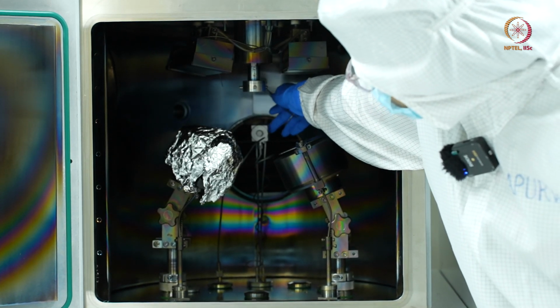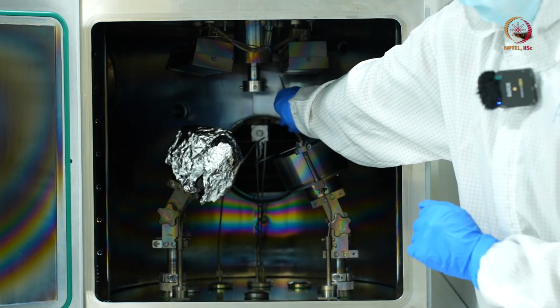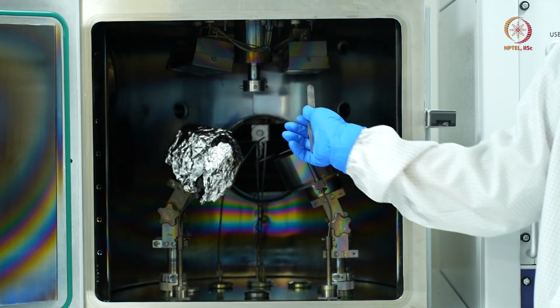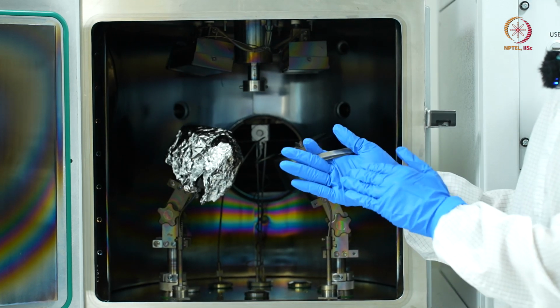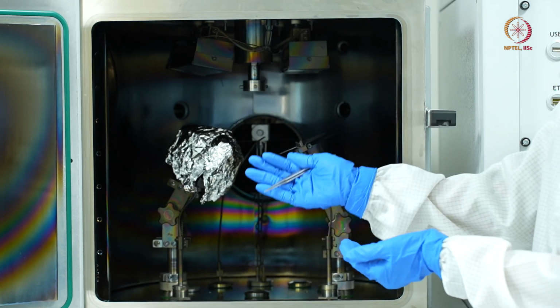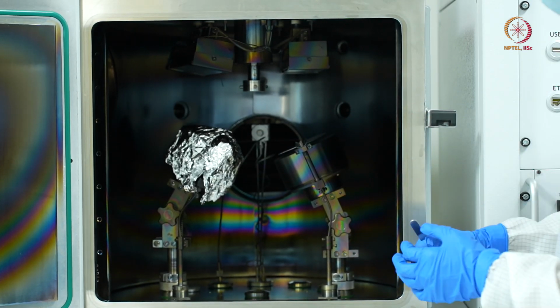And the last one you can see is the QCM. It's a quartz crystal monitor, which has a quartz crystal with its own resonant frequency. Once some mass gets deposited onto the quartz crystal, its frequency will change. That change in frequency will be used to calculate how much deposition has happened.